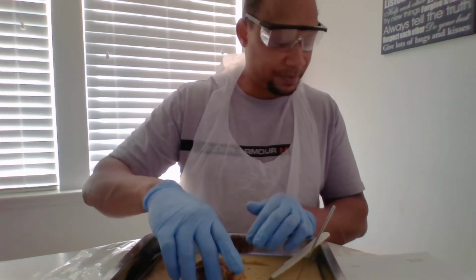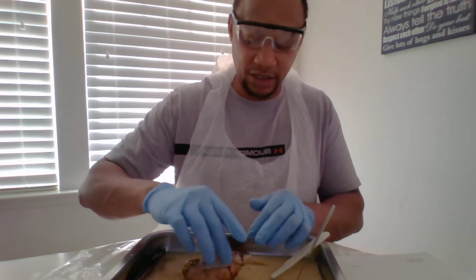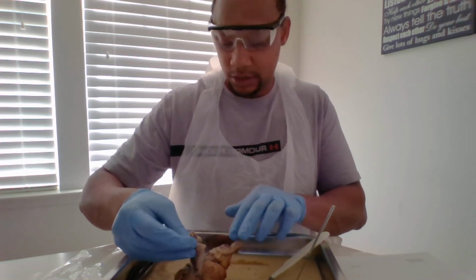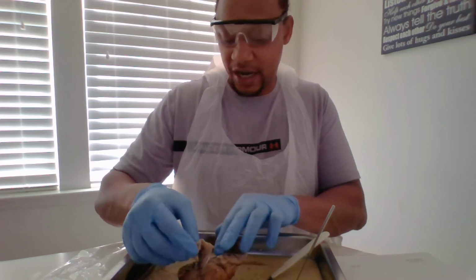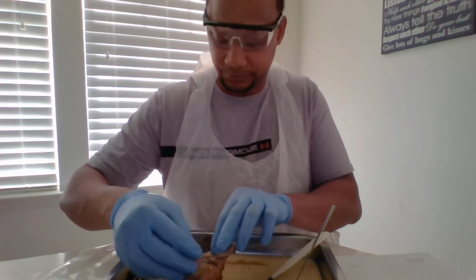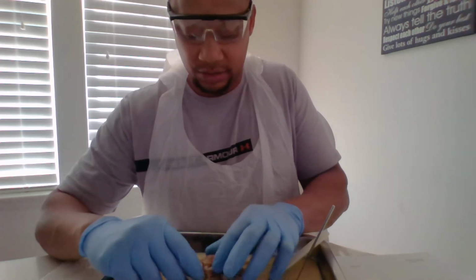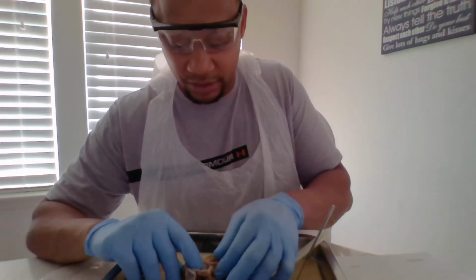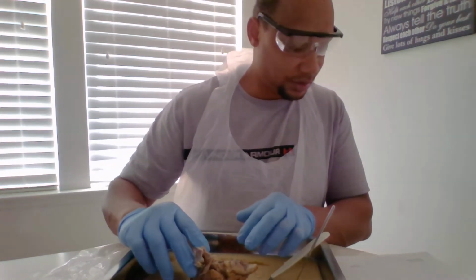For the pineal gland, I can't say these words. The pineal gland is easier to identify in the back. It's right here. These right here, that's the gland.